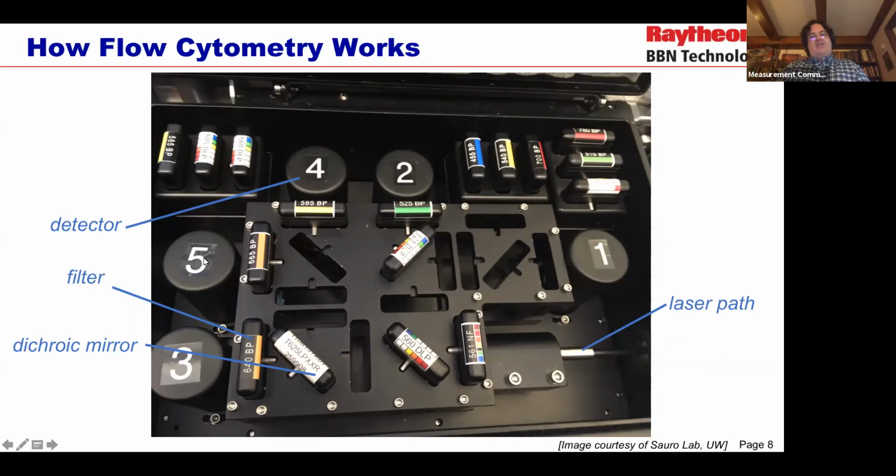And this detector over here, number 5, doesn't appear to be getting used in the current configuration. So you can see this is a very modular machine. It's even got a whole bunch of spare splitters and filters up in the slots at the top. So you can configure these around for all sorts of different, very specific measurement patterns if you want in a lot of cases. Not all machines are quite as friendly as this one for reconfiguration, but a lot are.